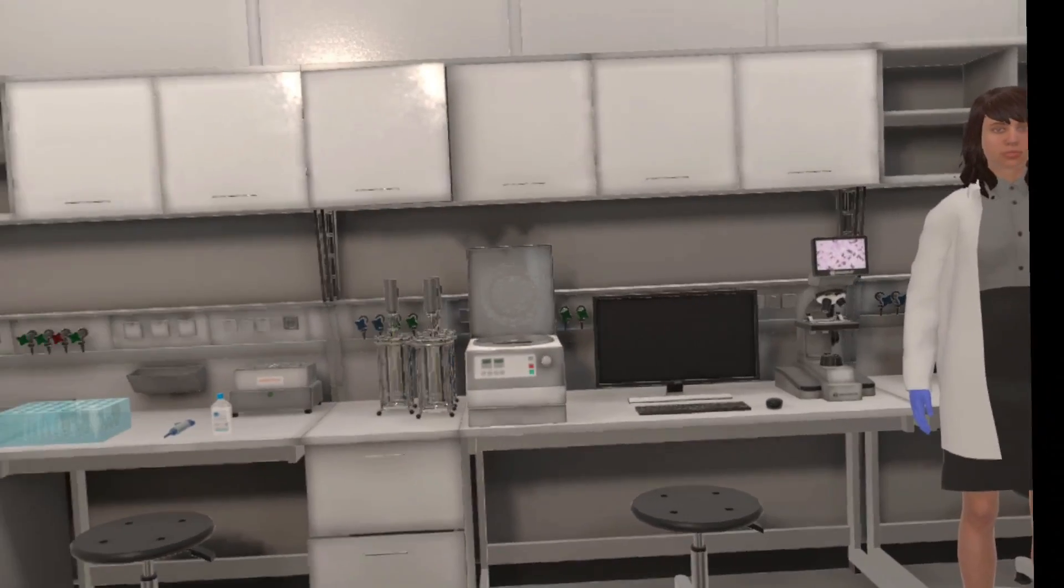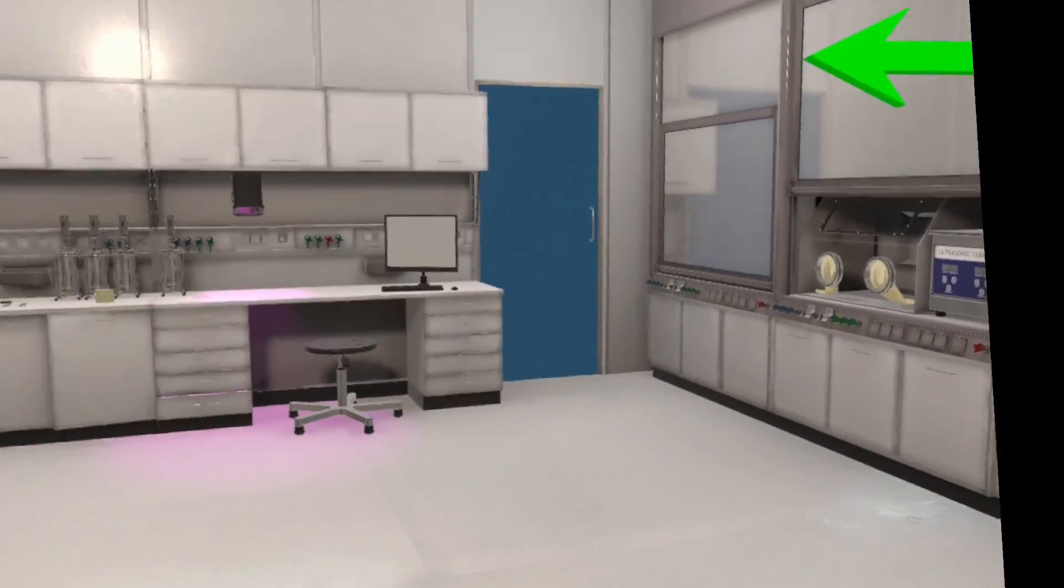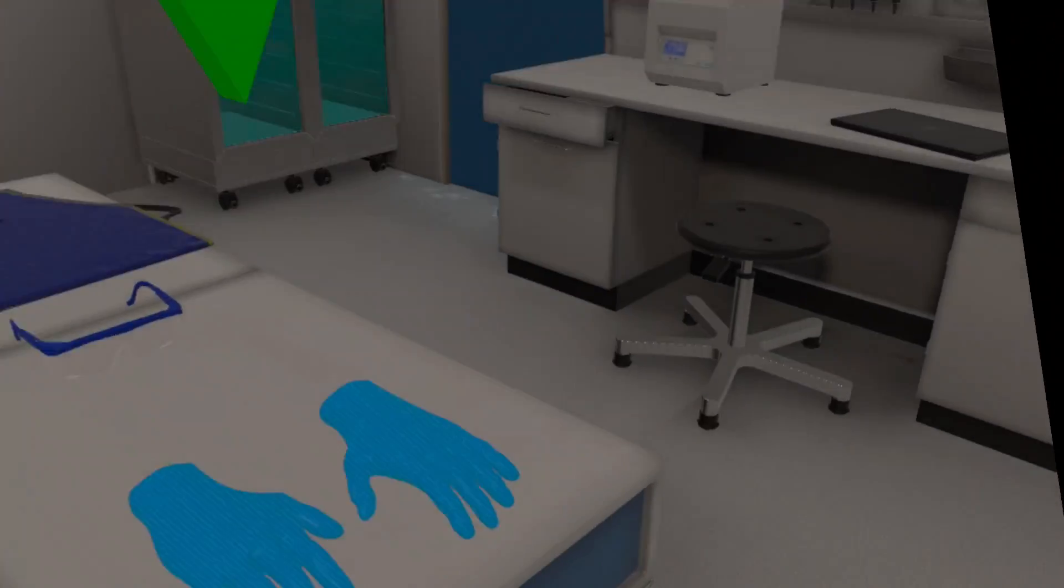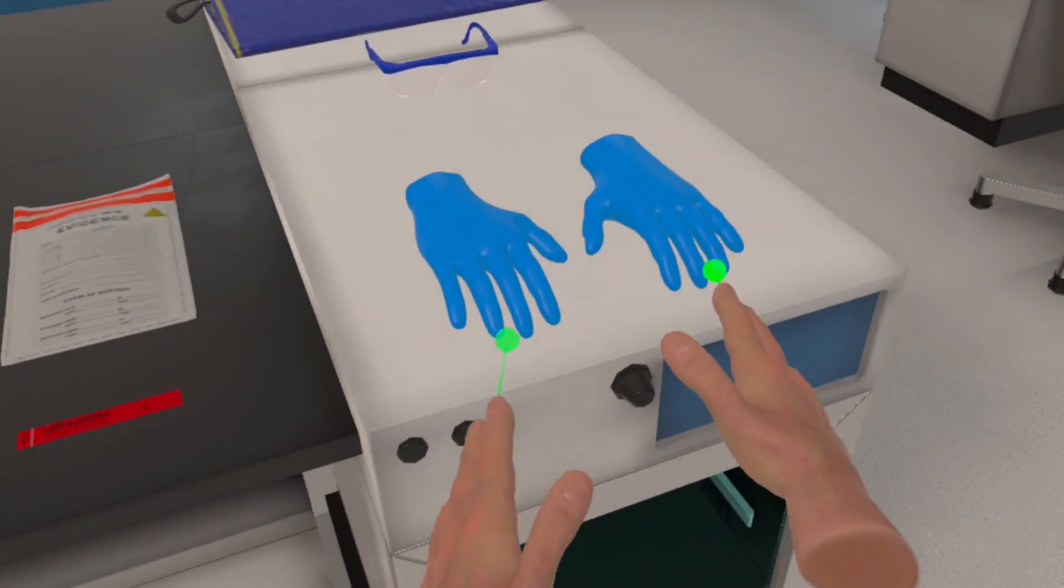Put on gloves, apron, and eyeglasses for safely assessing the evidence. It is also important that we don't leave our DNA on the evidence.